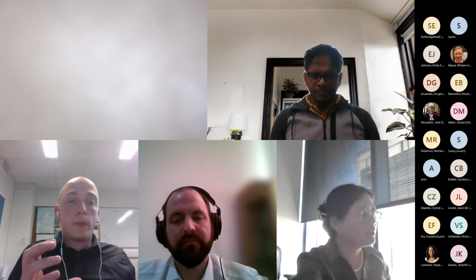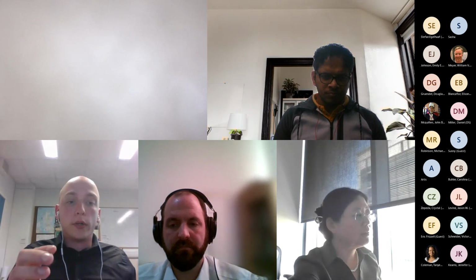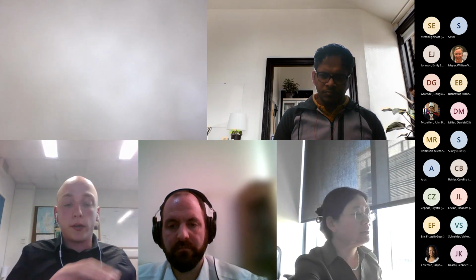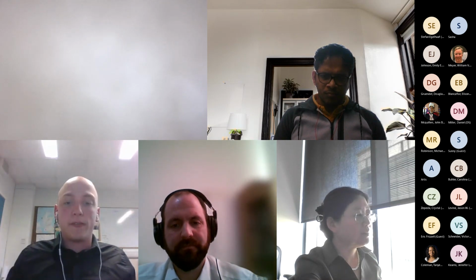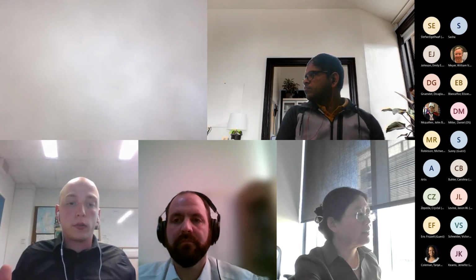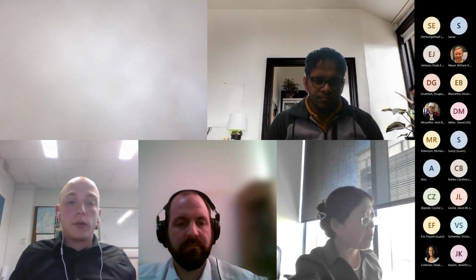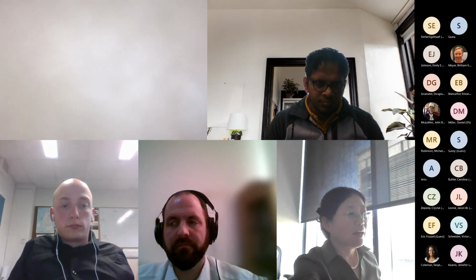Mm-hmm. Well, to some sense. A good example of that is the video I showed you where I cropped the video down and looked at the region between the large particles. I average everything effectively within that cropped region. But if instead of cropping, you were to break your video down into 25 segments, say a 5x5 grid, and analyze each of them separately, you can get some spatial information. I got it. But within those regions, you get an average. I see. And thank you very much.